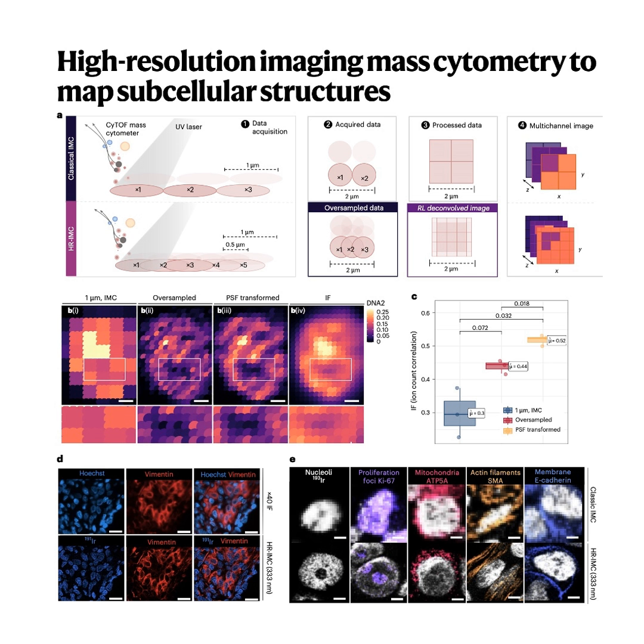For decades, researchers have been masters at mapping the vast cellular landscape of a tissue, identifying B cells, T cells, tumor clusters. The big picture stuff. Exactly. But when you want to look at the subcellular level, what's happening inside a single mitochondrion, or how DNA repair proteins are interacting with the nucleus, that's where the technology has, well, hit a wall. Yeah, it's the ultimate resolution puzzle.